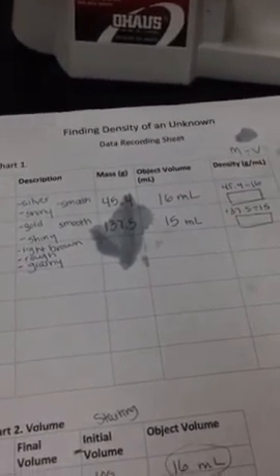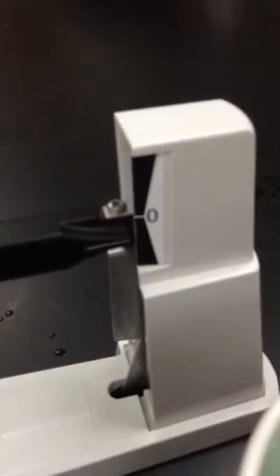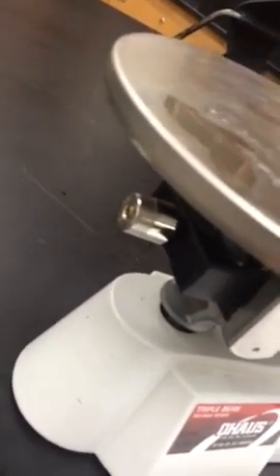Okay, and then the next thing we need to do is weigh our block. So if you look, my scale's been reset. Everything's at 0. But if you look over here, my 0 is a little bit messed up. So I want to try and recalibrate so that we're getting an accurate reading on our scale. There's a little knob right back here. By turning it one way or another, that recalibrates whether it's at 0 or not.